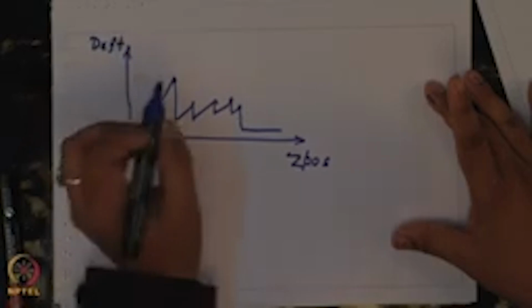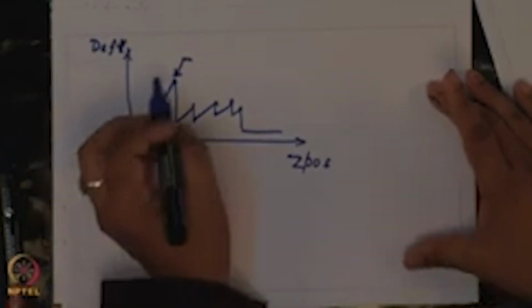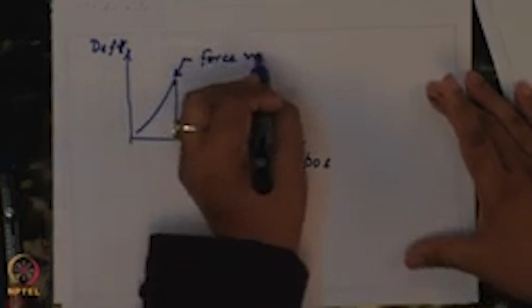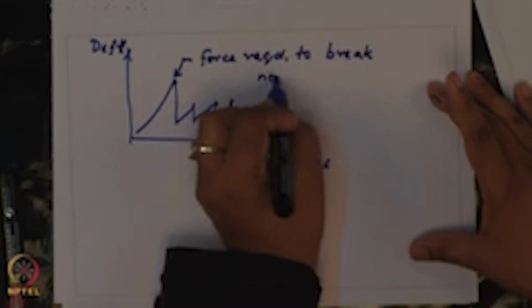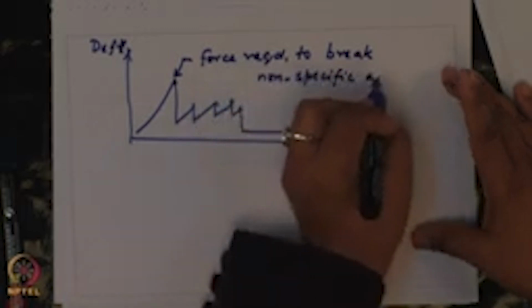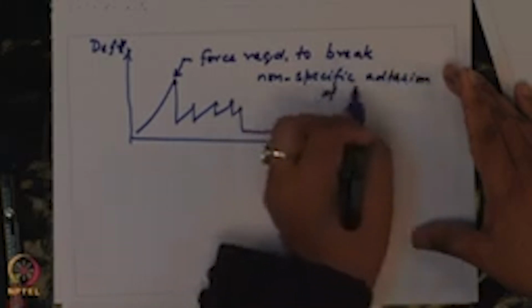Deflection. Okay. So, this peak corresponds to the force required to break non-specific adhesion of protein to surface.